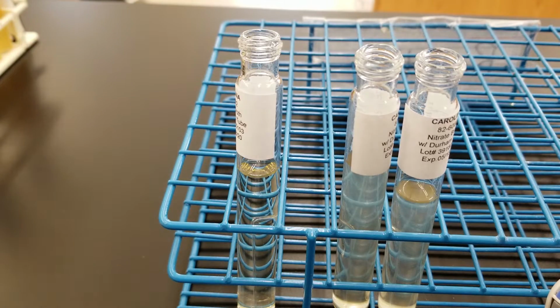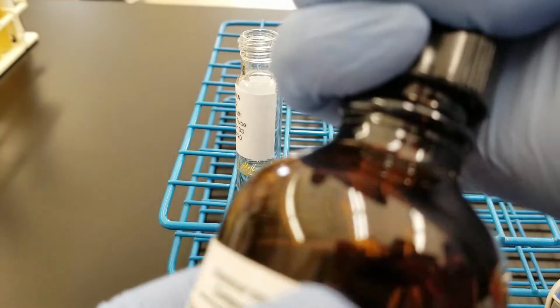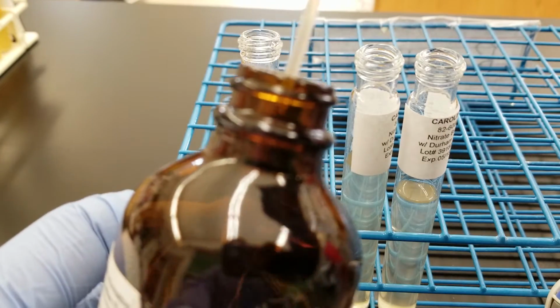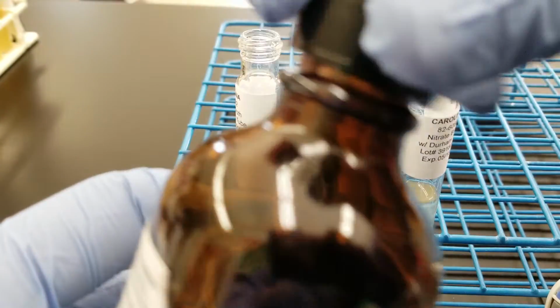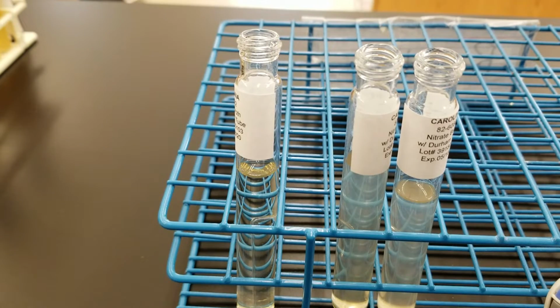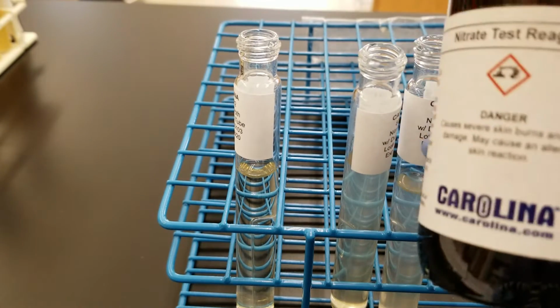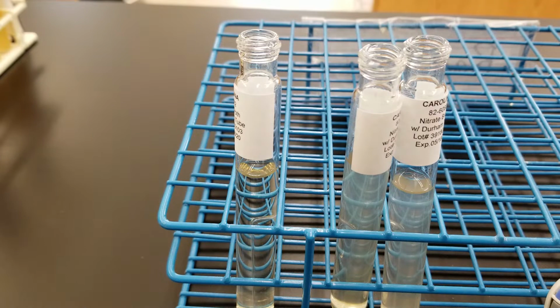Whoops. Okay, so the excess of the reagent that I still have in my pipette, since it's still clean, I can put back in there. All right. Close it up again. So we do that one first. Then we're going to add reagent B. Same thing. You don't want to leave it open because of the health hazard.